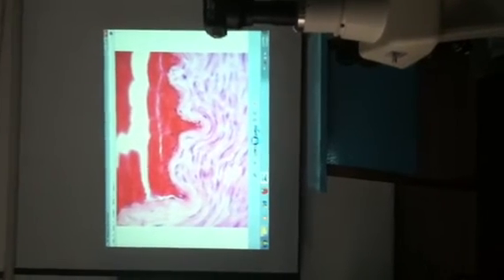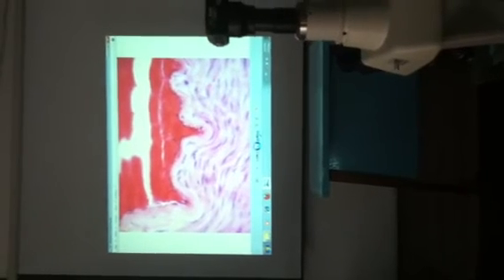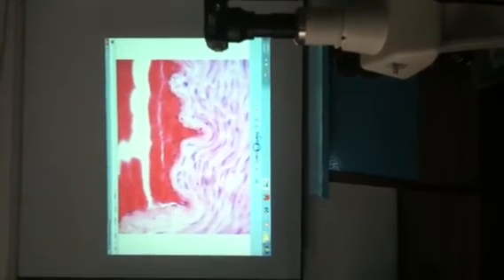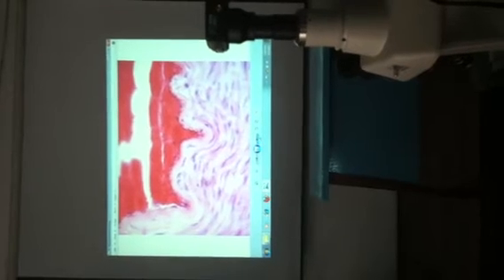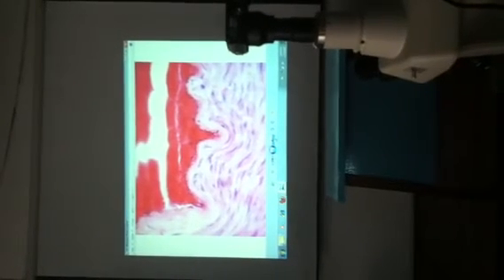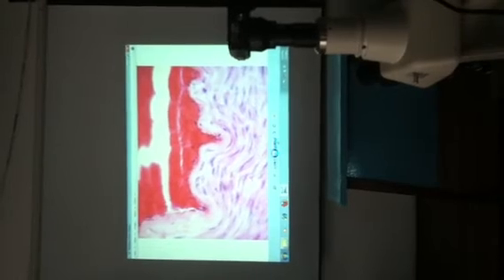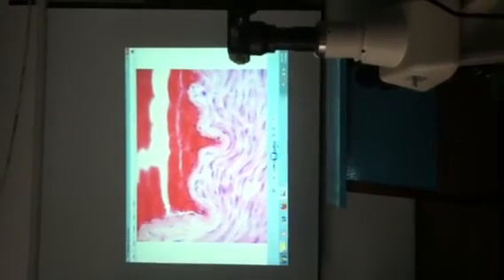What were your drawings like? You were concentrating on this. This is the connective tissue. This is the tunica media. If you were concentrating on this, you will see several layers, and it will not be simple squamous anymore. It will be stratified kasi ang daming layer. But that is not the epithelium. The epithelium is that. Okay?